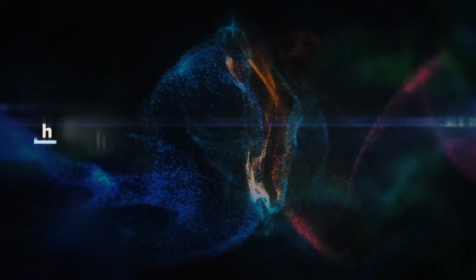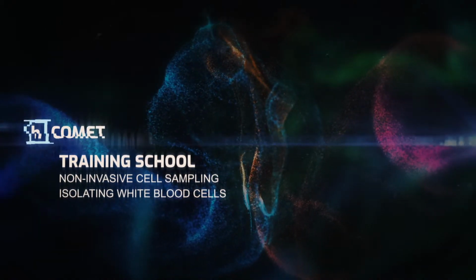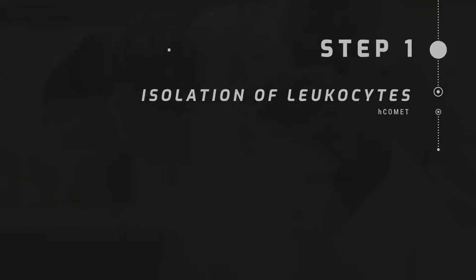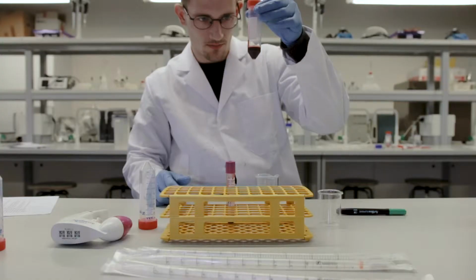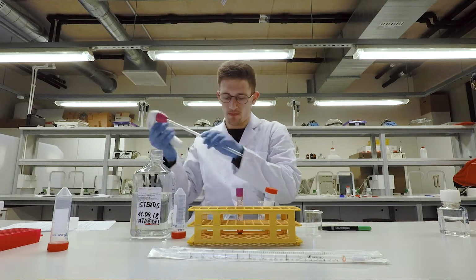Hey guys, in this video we are going to show you how to isolate mononuclear cells and granulocytes from blood and how you can put them into the COMET assay to detect DNA damage. So the first thing we do is dilute the blood one-on-one with PBS. You can just pour it in, you don't have to do it very accurately. You can just estimate the amount of blood and then pour in the amount of PBS.